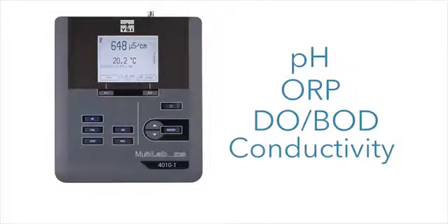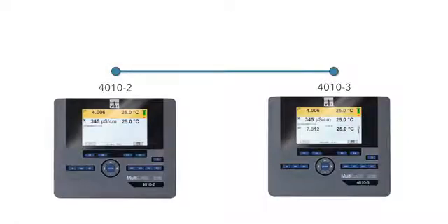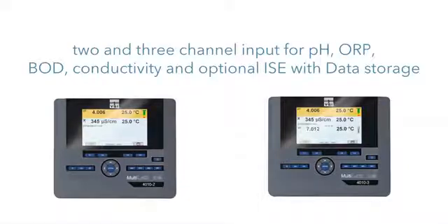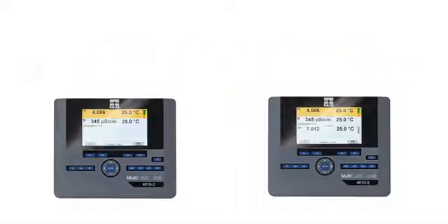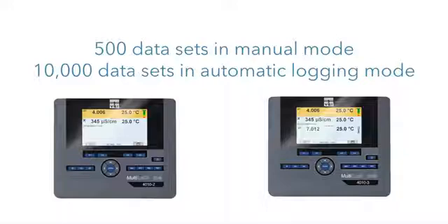5,000 data sets in automatic logging mode. The models 4010-2 and 4010-3 have two and three channel inputs for pH, ORP, BOD, conductivity, and optional ISE with data storage: 500 data sets in manual mode, 10,000 data sets in automatic logging mode.